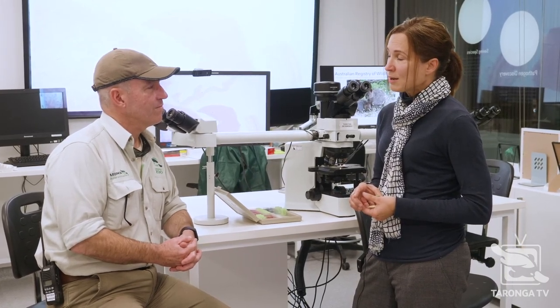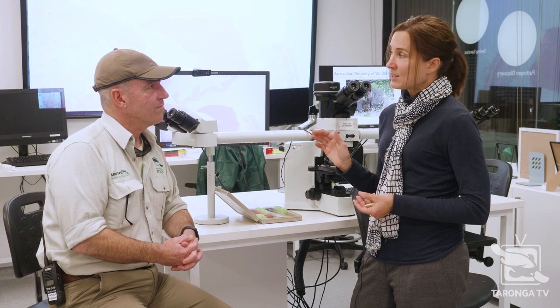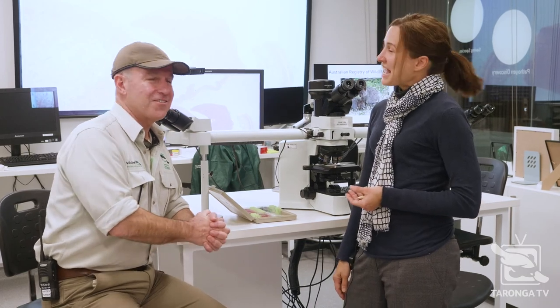Right now we're working with the medical school at the University of Sydney, Professor Eddie Holmes, and we can run a metatranscriptomic approach where we sequence all the RNA in the sample. Might just get you to translate that for us. Yeah, so what we're looking at is all of the genetic material in the sample. So we exclude the host DNA, and we're looking at all of the RNA, which will let us know what bacteria, viruses and parasites live in there.